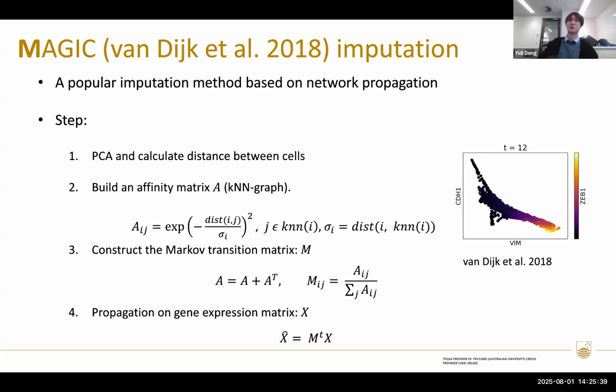What's the distance metric here, Euclidean distance? Yes, Euclidean distance. So it's very simple, a Gaussian kernel applied to the distance measure, but the kernel width is adjusted for each neighborhood. So it's called an adapted Gaussian kernel.